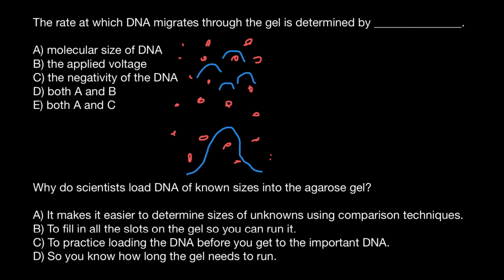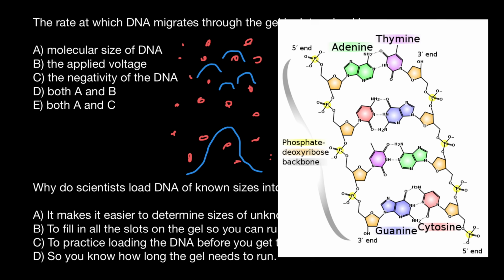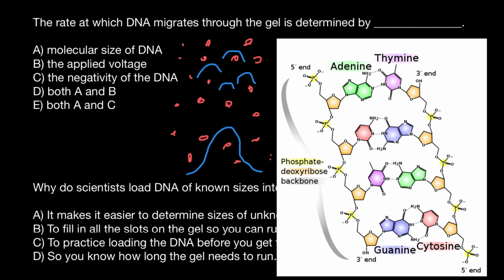If we take a look at this picture, we would see that double-stranded DNA is slightly negatively charged. Take a look. Negative charge here, here, here, here, here. So we can find negative charge on the oxygen, which we can find on the backbone of the double-stranded DNA, or it can be single-stranded DNA. Our slightly negatively charged DNA moves away from the negative charge and towards the positive charge, because DNA itself is slightly negatively charged, so it's going to move in this direction.